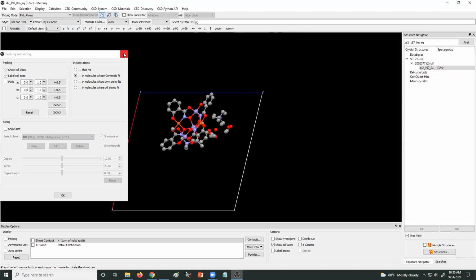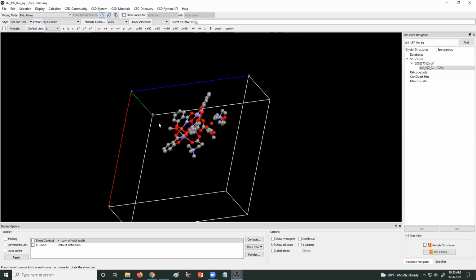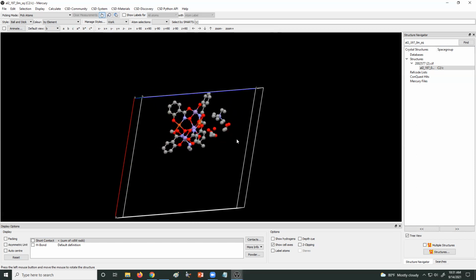I want to show you one last thing, and that's determining the powder pattern, okay? Bear in mind that when people determine the structure of a single molecule, you need a single crystal that you subject to X-ray beams, and you work backwards from the X-ray diffraction pattern. It's some very interesting physics and physical chemistry to work backwards, and you can get very, very precise, better than NMR, better than any structural tool you can use. Crystallography gives the precise distances and bond angles of the atoms in the solid, in the molecule. The only downside is it has to be a solid, because you can't easily do X-ray diffraction if it's a gas or a liquid, since there's no regular pattern. It has to be a crystalline solid to do this.